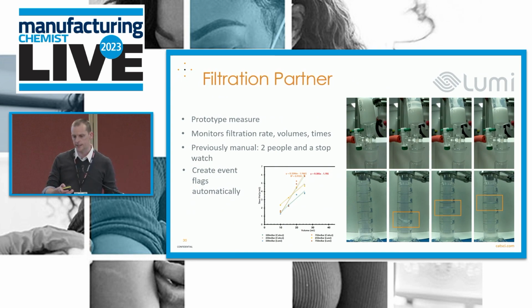Another colleague set up a system in collaboration with Lumi, which is monitoring this filtration. This is a common rate of filtration experiment, a filterability measurement. So how fast does a material filter? What the Lumi camera is doing is essentially measuring the meniscus in this flask and then reporting the values back.